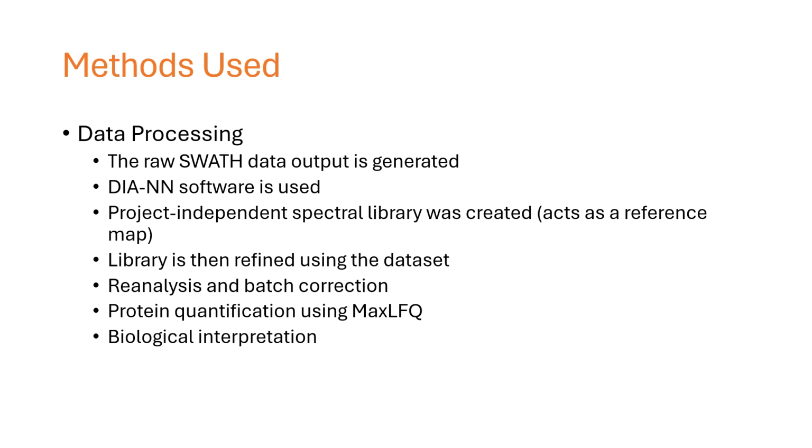They reanalyze everything, make any batch corrections, run it through a protein quantification software, and then lastly they make the biological interpretations.